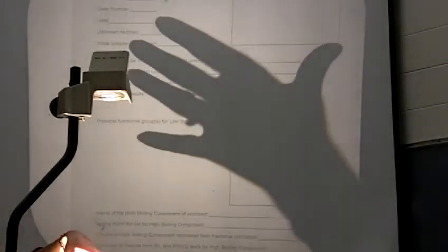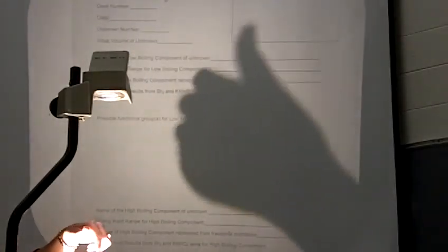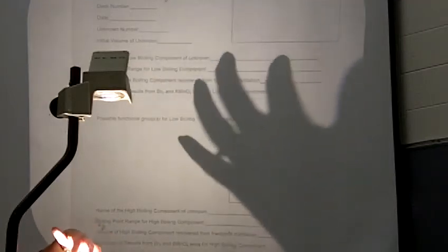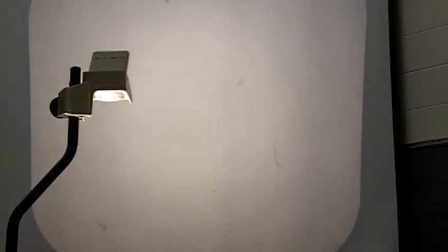And then for your report sheet, it's double-sided, so you have information to complete about the low boiling component, information to complete about the high boiling component. And then on the back side, you're going to draw or attach your graph. Computer-generated graph is probably best. And then you'll answer questions, okay?